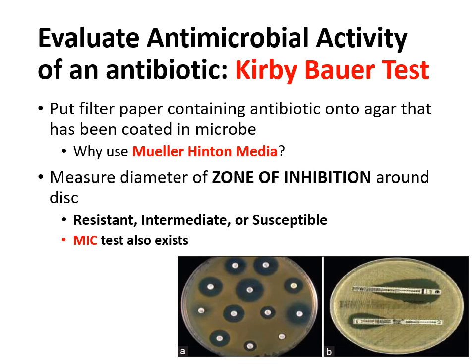So the plate itself would be inactivating the antibiotic. You would see no killing of the bacteria, and you might assume that that bacteria is resistant, when in fact it's just that the plate messed up your experiment. So that's why Mueller-Hinton is so important. It will not inactivate any of the antibiotics.